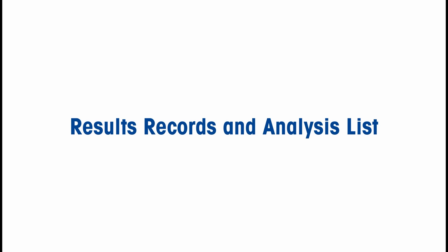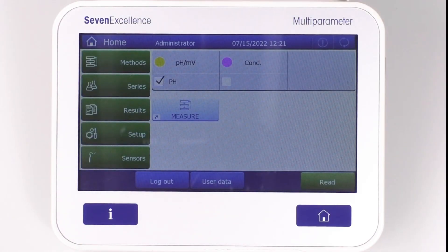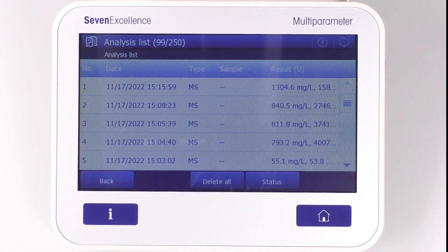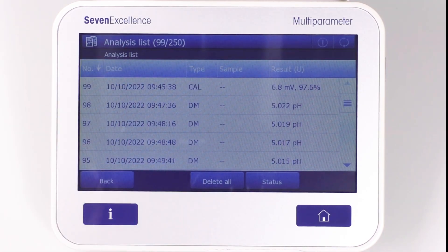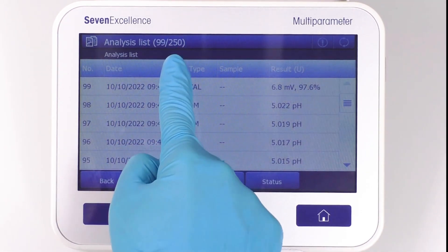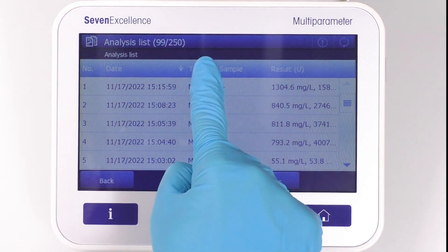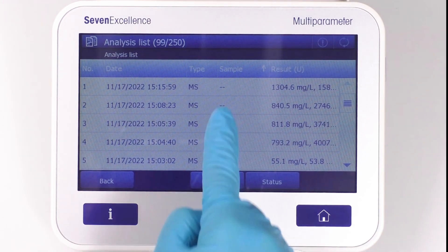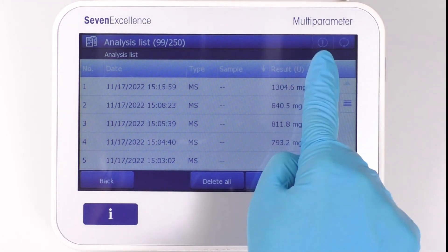Results, Records and Analysis List. Now that you've created and assigned your sensors, it's time to move on to the exciting part: viewing the results. To do this, simply click on the Results menu. Here, you'll find all your results grouped in a list that can be sorted by number, date, type, sample, and result.